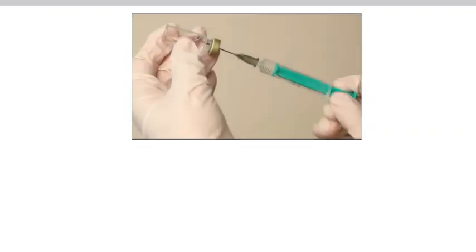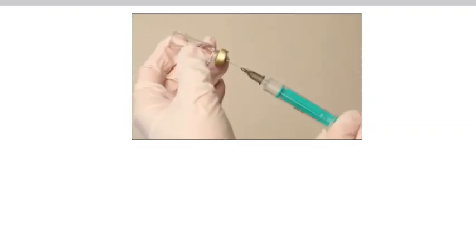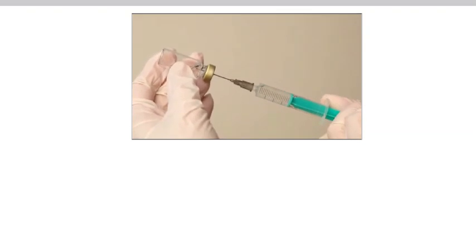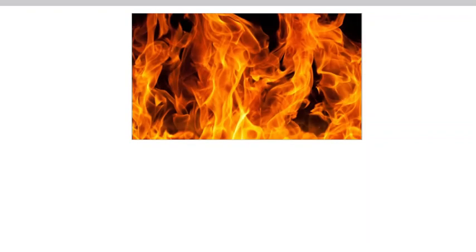A young research assistant at a West Coast lab was working with a pyrophoric chemical, T-butyl lithium dissolved in a liquid. While using a syringe to withdraw a quantity of the reagent, she apparently pulled the plunger completely out of the syringe barrel and spilled liquid onto her synthetic sweater and nitrile gloves. Introduced to air, the liquid ignited immediately, and she sustained second and third degree burns over 40% of her body. She died 18 days later of those injuries.